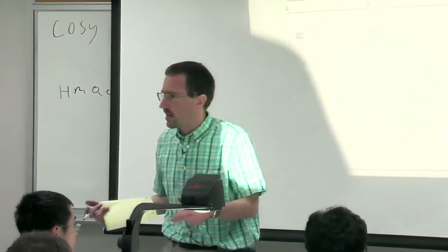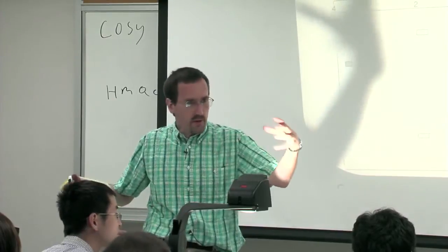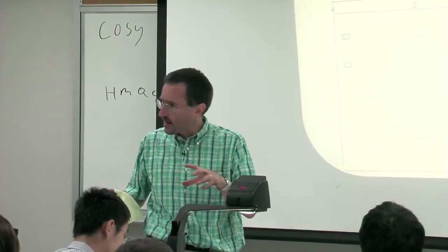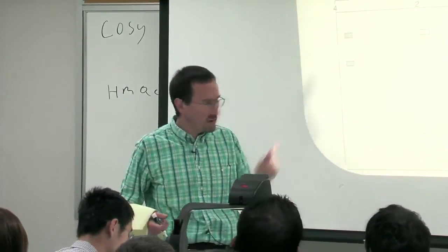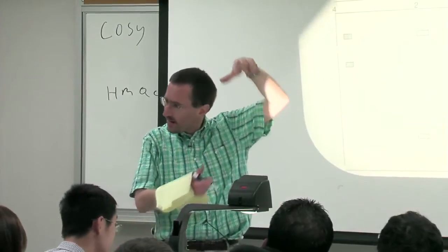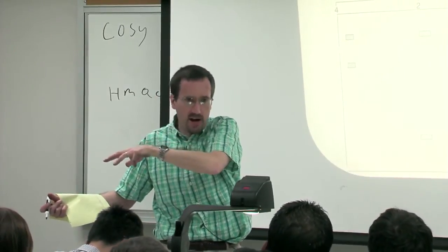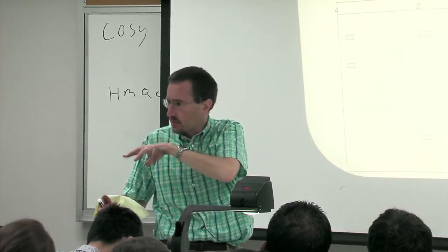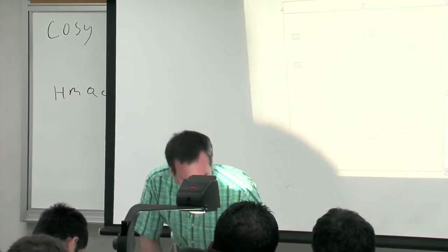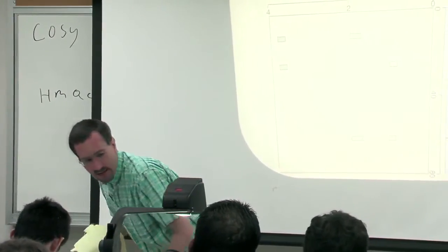I know this molecule has an isolated methyl group. When you're getting to that point and you have these fragments and you're saying, now how in heck do I systematically put them together? This is where HMBC shines, where you say, oh, now I can see that this fragment is somehow connected to that fragment, where you have these isolated spin systems and you're trying to put them together. So I'll give you the schematic of an HMBC right now.